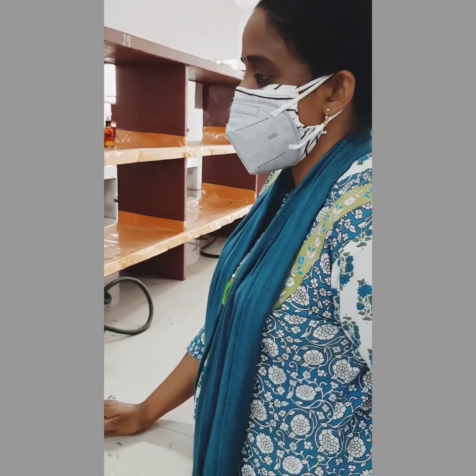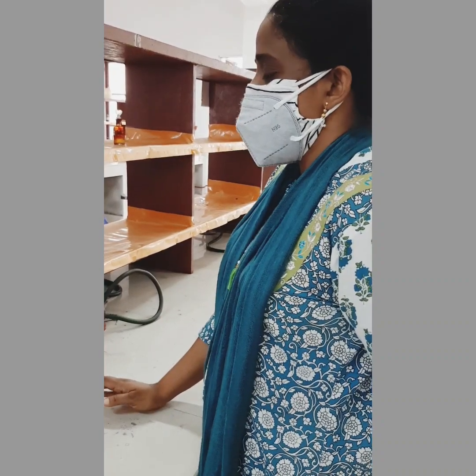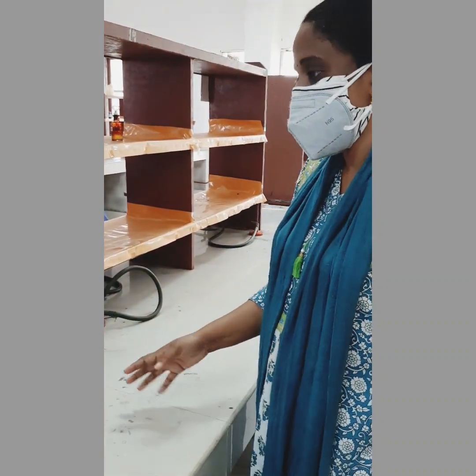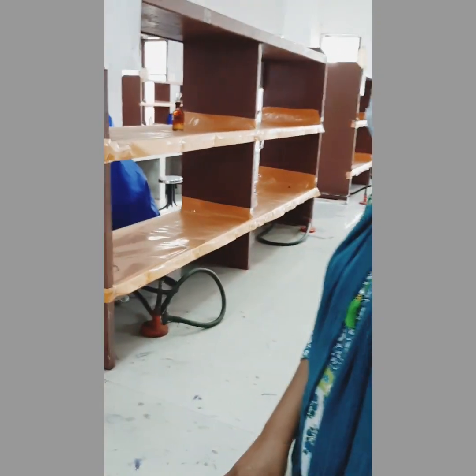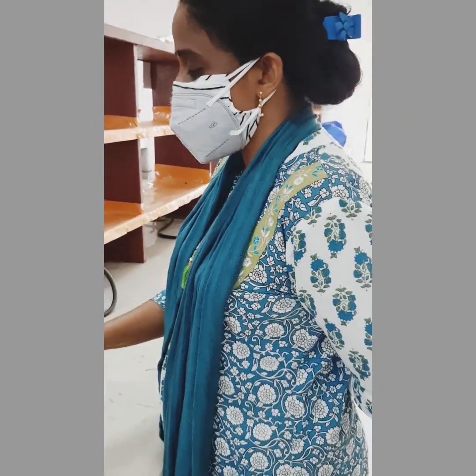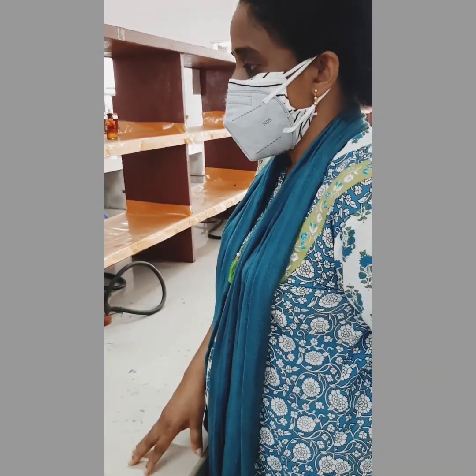Mainly for mycobacterium species, it can also be used for the demonstration of other organisms like Nocardia, Cryptosporidium, spores, etc. So here we are doing staining of Mycobacterium tuberculosis. You should be careful because we are working with samples from TB patients.